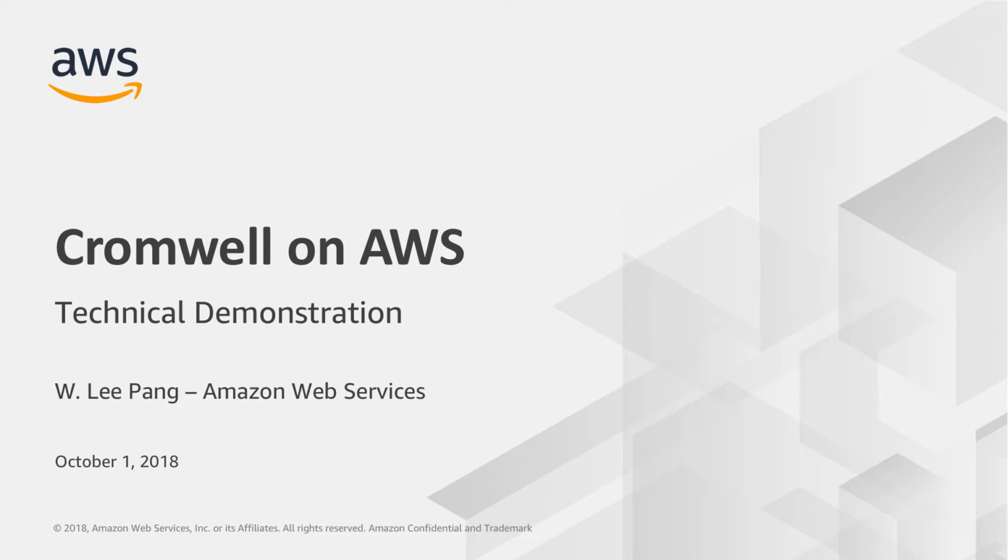In this video, I'm going to give you a quick demonstration of running Cromwell on AWS. If you haven't already, I recommend that you watch our webinar that goes into the details of genomics workflows, patterns and services, and how to use Cromwell.